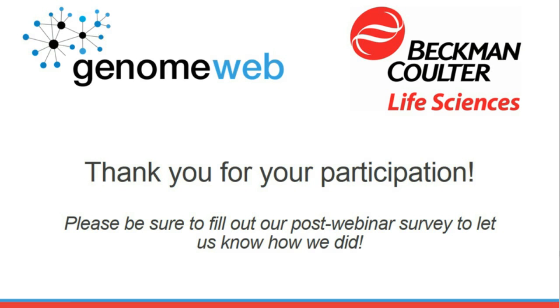Great, thank you. So Davoud, back to you. Are miniaturized libraries more uniform? Have you found that in your research? Yes, with the NanoGBS, we had more uniform libraries in terms of the volume, and at the end with the sequencing, we've seen that the libraries prepared with the NanoGBS approach were more uniform than the standard or the conventional libraries.